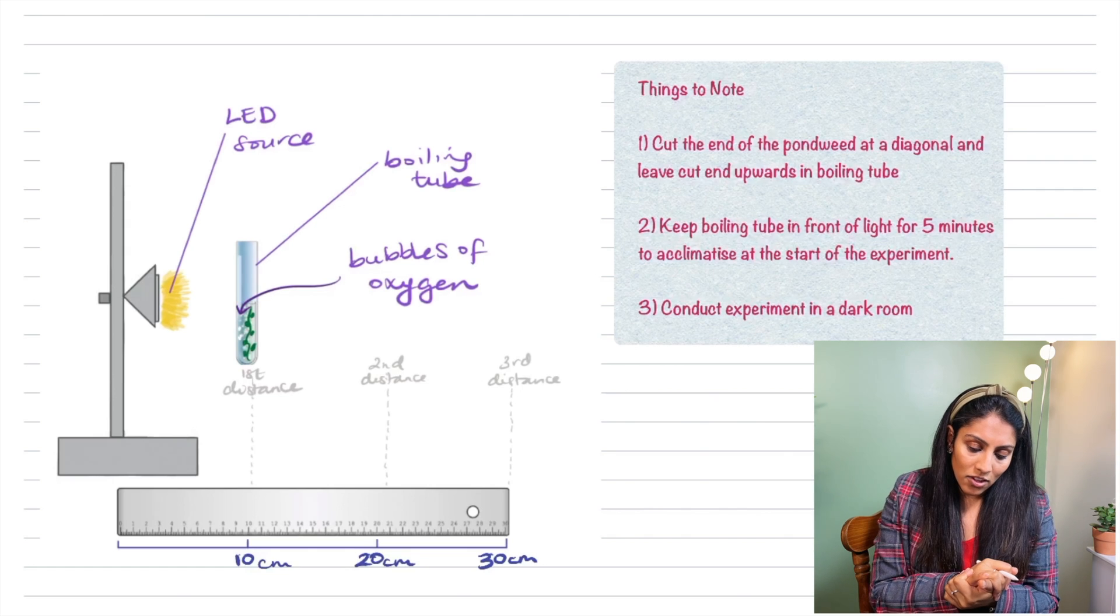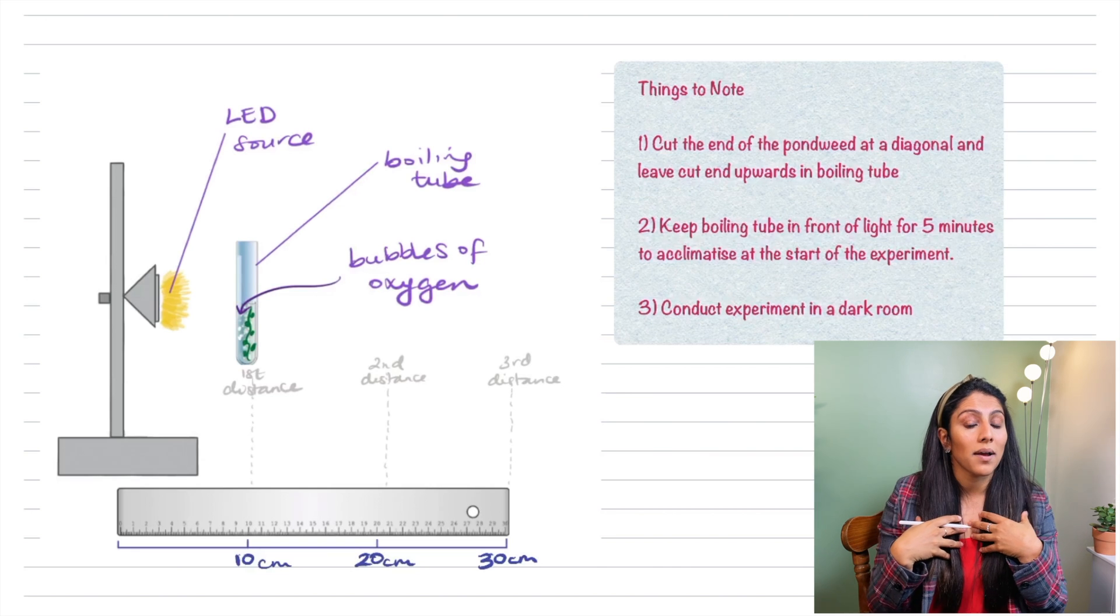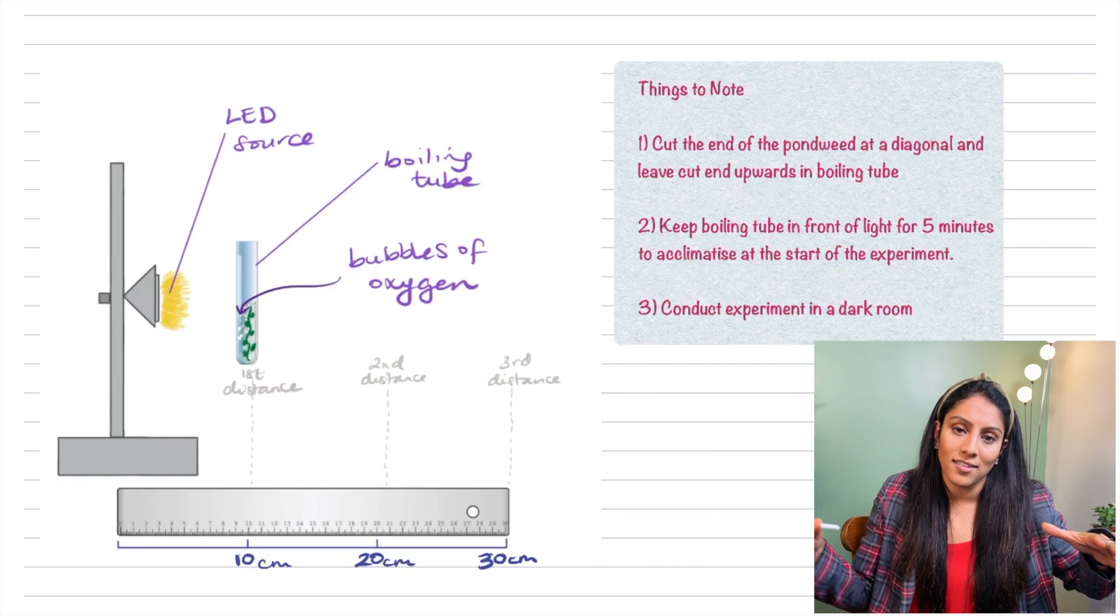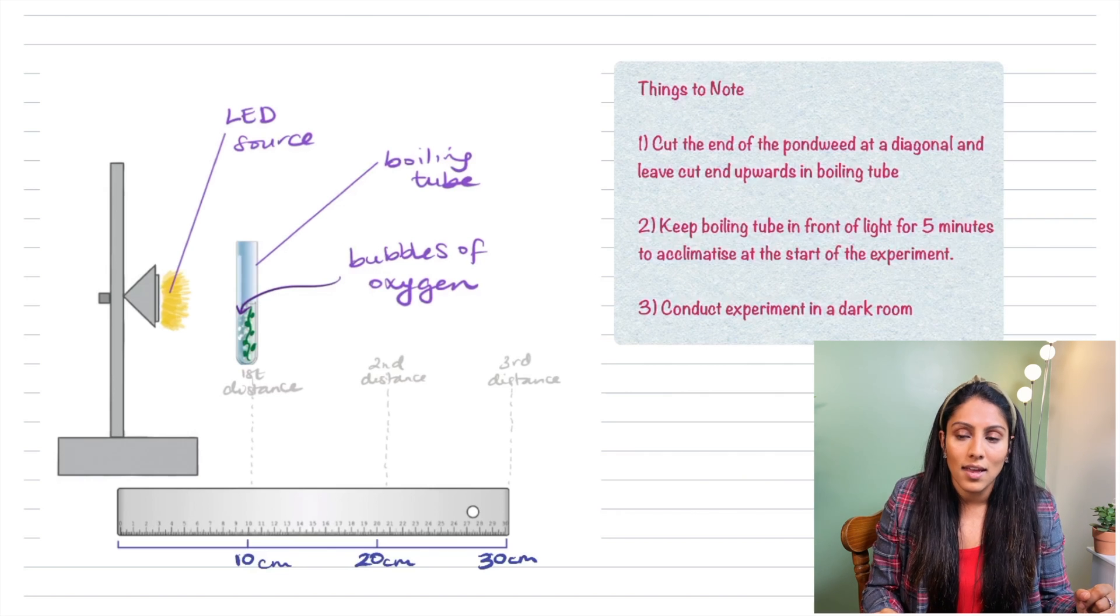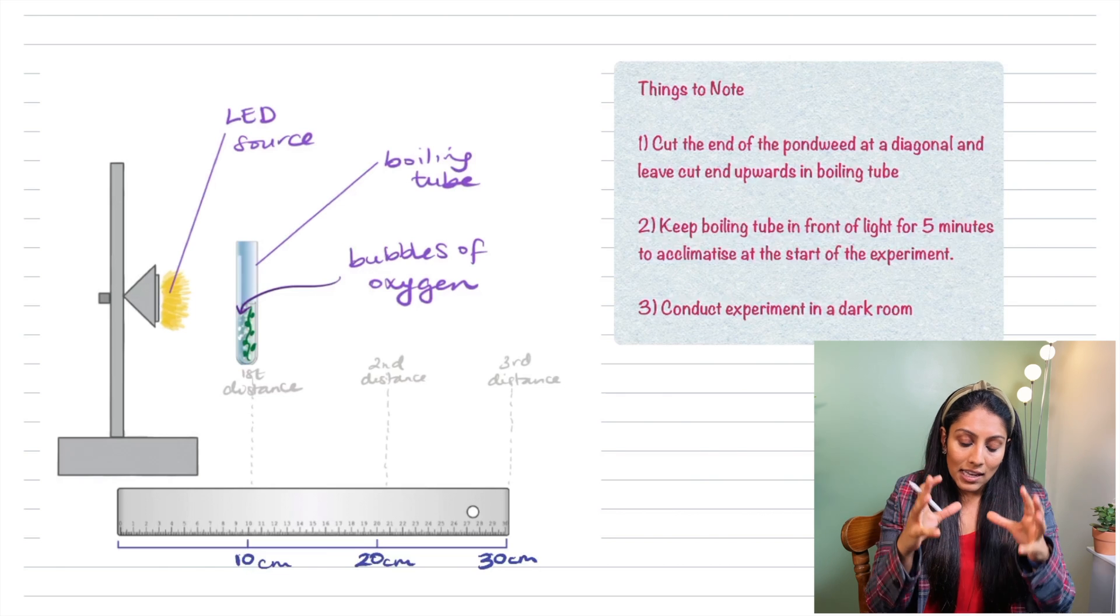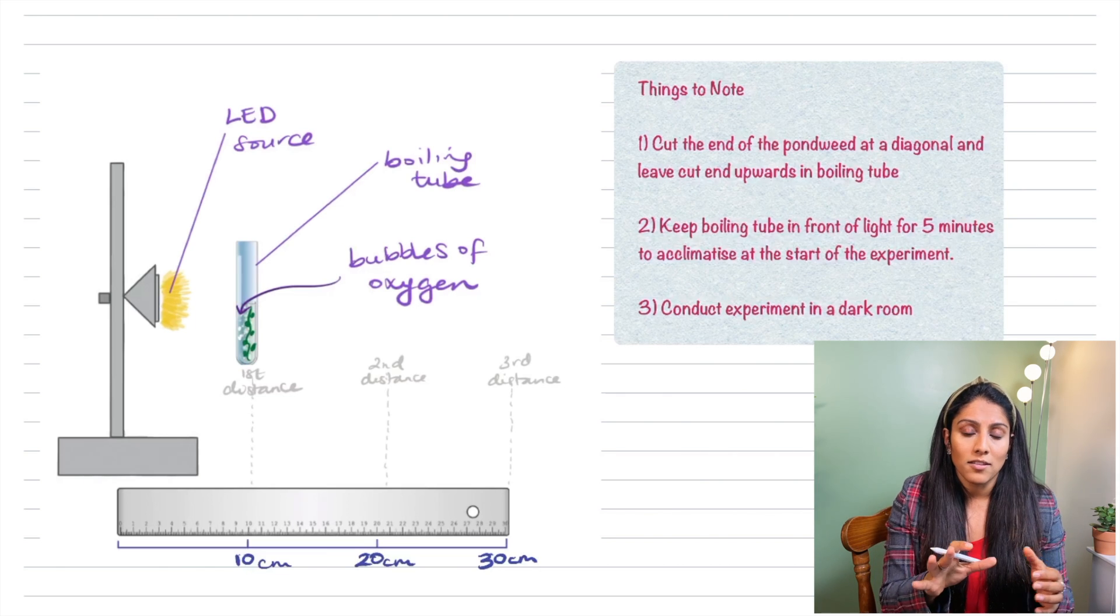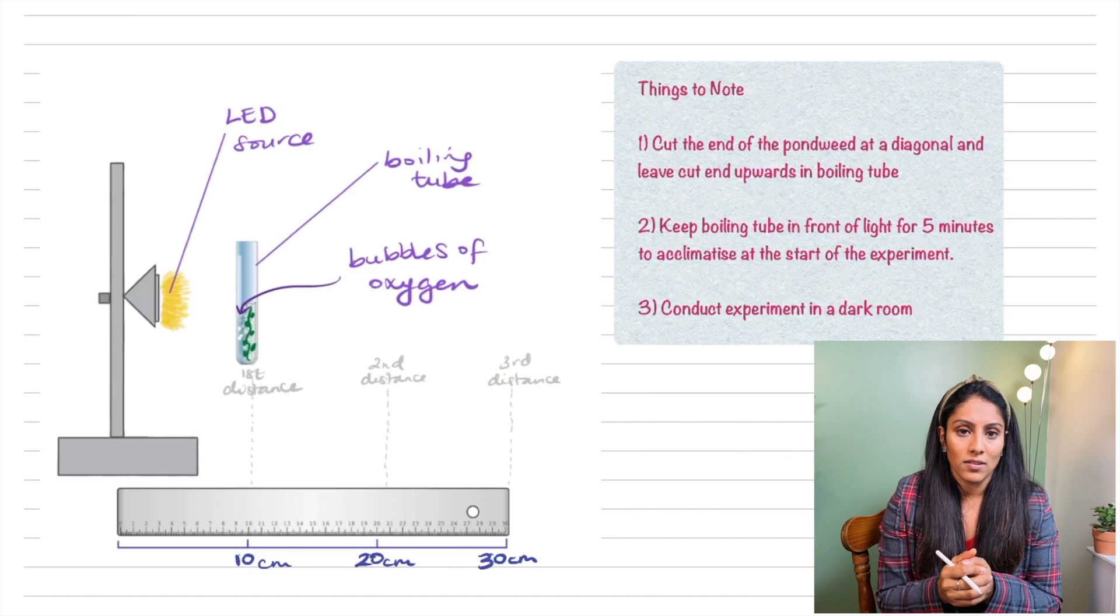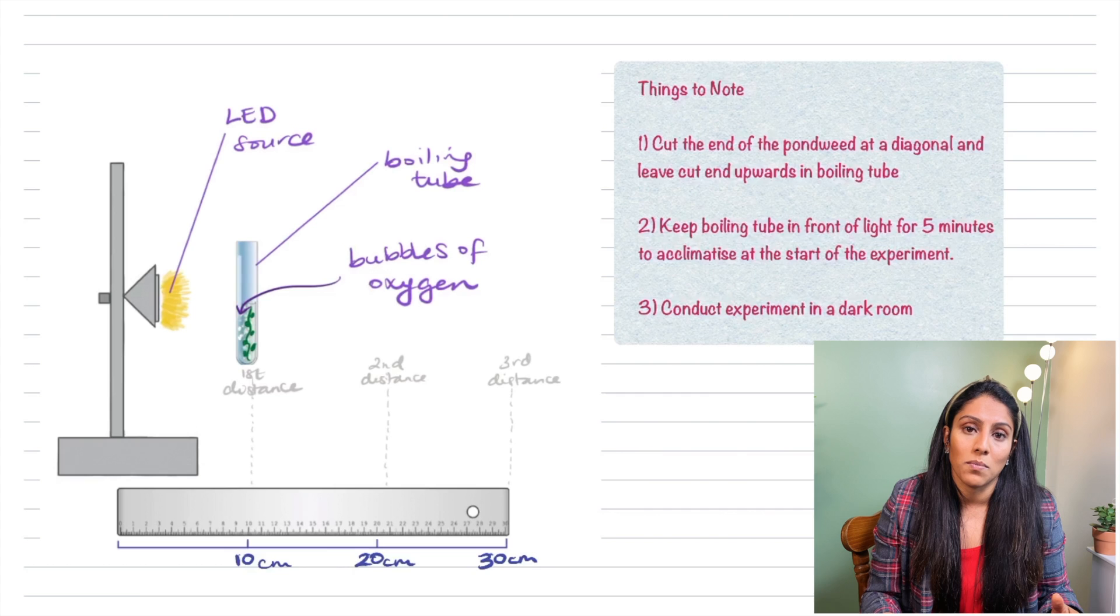The second thing that you want to be aware of is that you should conduct the experiment in a dark room. When I do it in my classroom I shut all the blinds because the only light we want is the one that comes from the LED source. Thirdly you're going to leave the boiling tube and the pondweed in front of the light for five minutes before you even start taking results to allow the pondweed to acclimatise to the experiment and to the light.